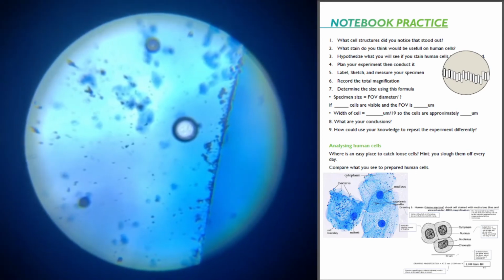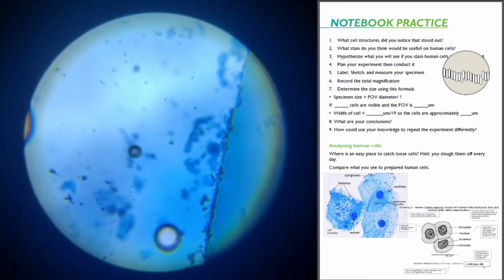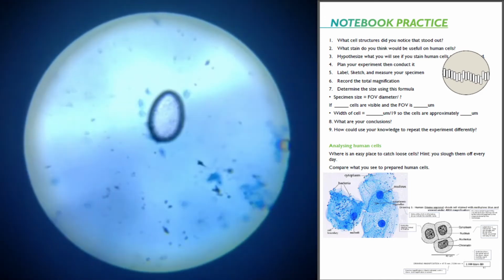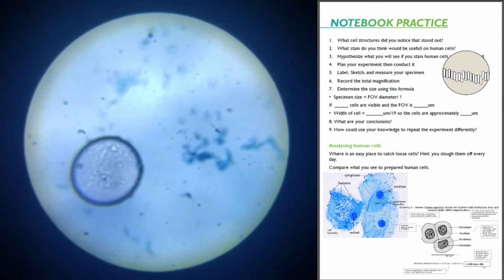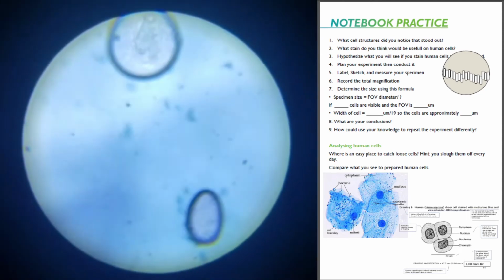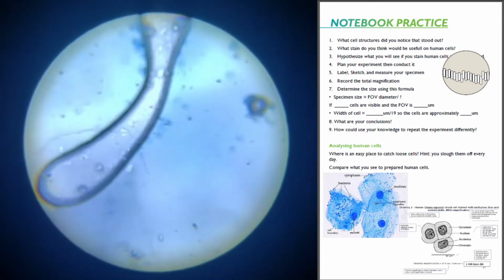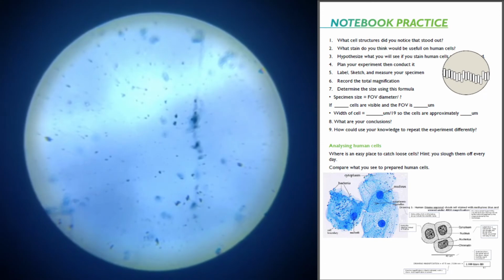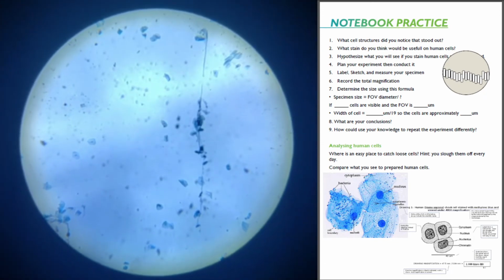Lots of cells. Huh. Air bubble. There are a lot of cells. See them all?